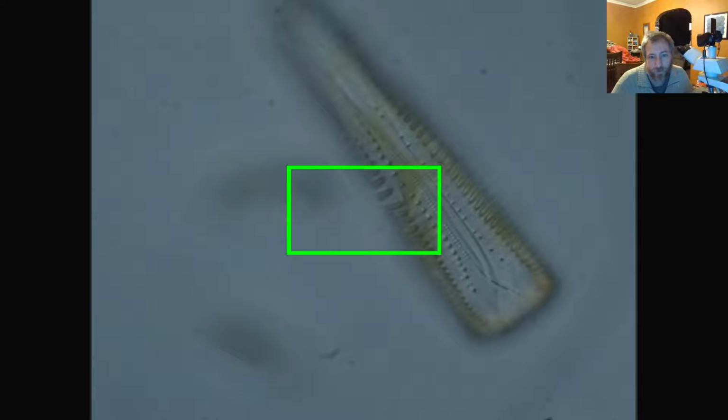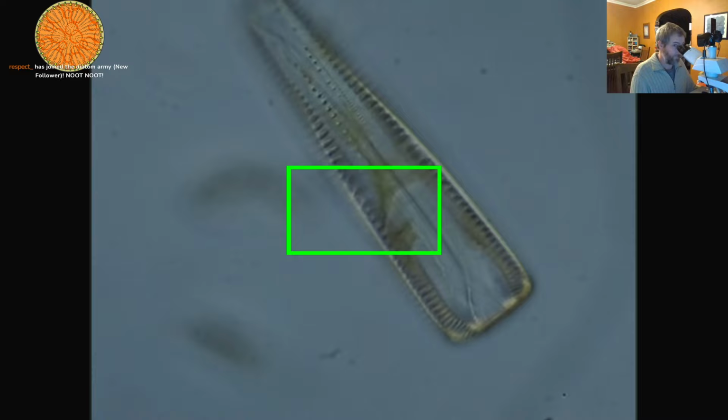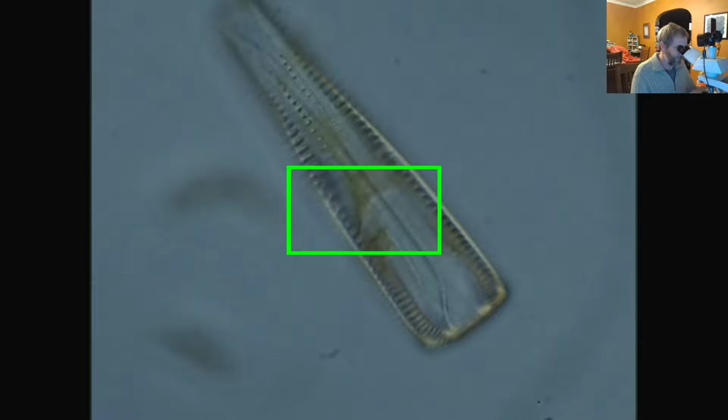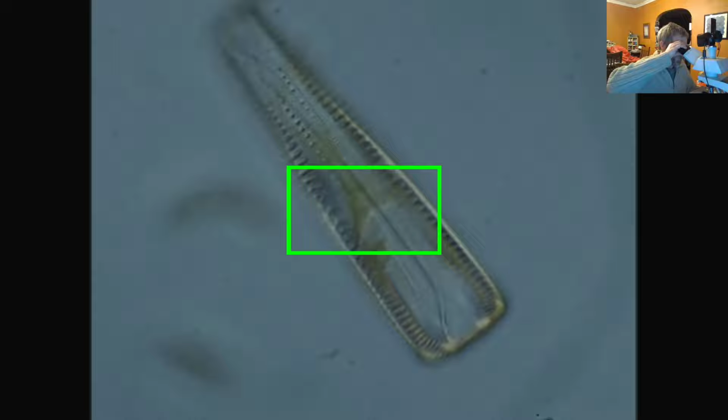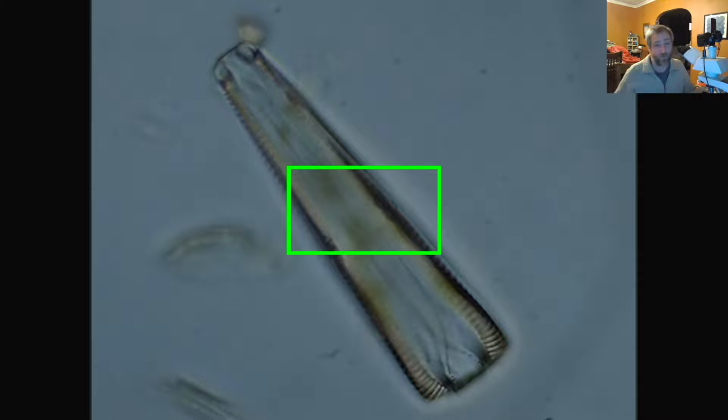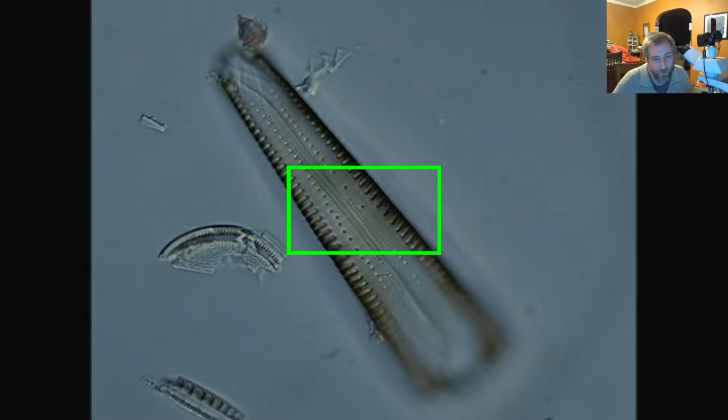So this diatom is actually quite large. It startled me. For gomphonema, usually they don't grow this big. Hang on a second, because I can only measure it with my eyepiece, by turning my little scale bar, the reticle, around. This one is almost perfectly 100 microns long. So gomphonema typically don't grow that big. It's pretty uncommon for the true gomphonema to grow that large.